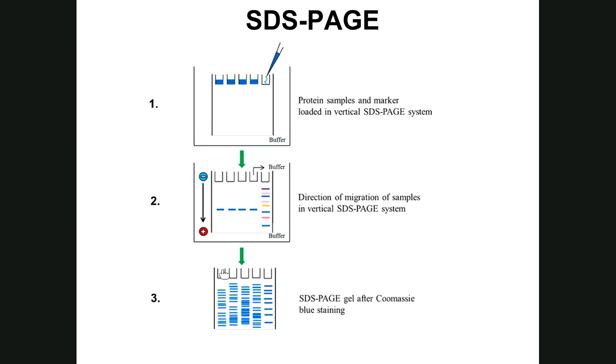So well 1 turned into lane 1. Well 2 turned into lane 2. Well 3 turned into lane 3, and so on and so forth. This is important to know for next week. Okay, and I'll try to remember to repeat it again.